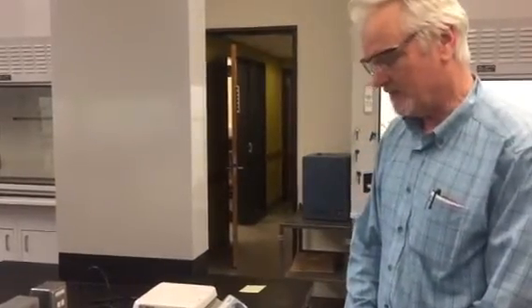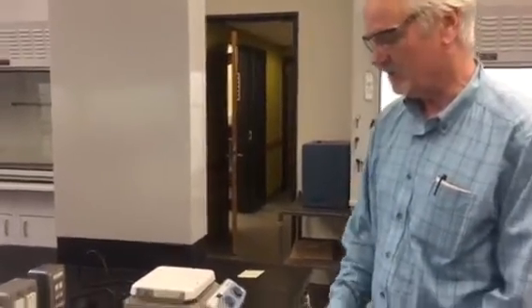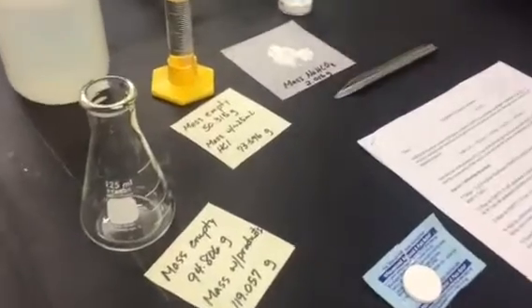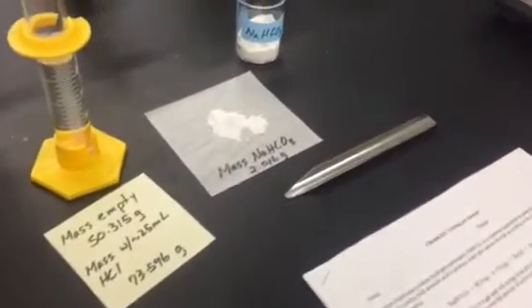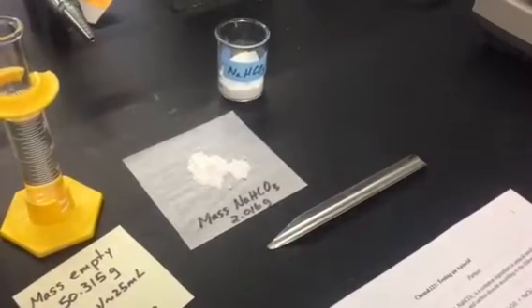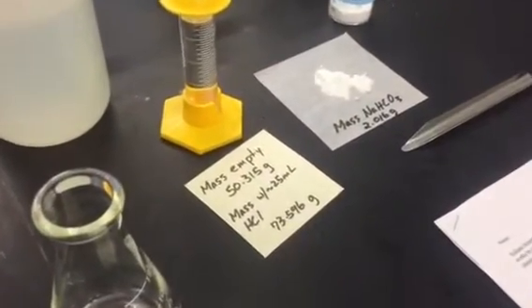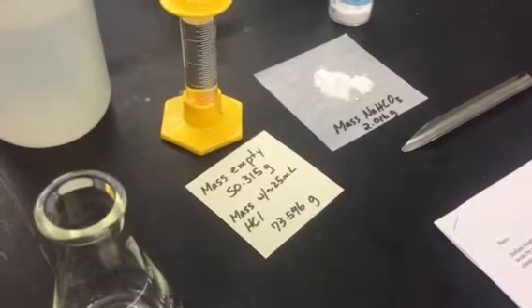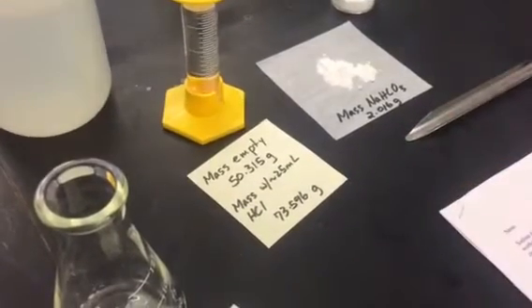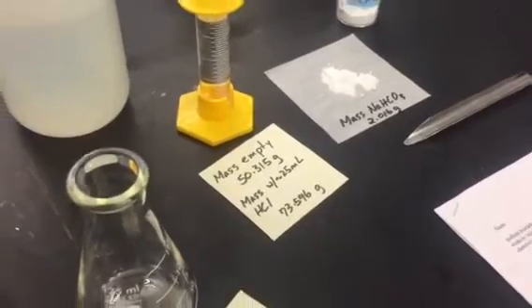The key to this lab is to take very, very careful mass measurements, and as we've laid out here on the bench, I've indicated the stuff that you're going to be weighing. You're going to mass out about 2 grams of sodium bicarbonate in the balance room. The exact amount doesn't matter as long as you know exactly what it is. And then you're going to mass an empty 25 milliliter graduated cylinder, put in about 25 milliliters of acid, and again the exact amount doesn't matter because then you're going to mass it again so that you can figure out the mass of the acid.